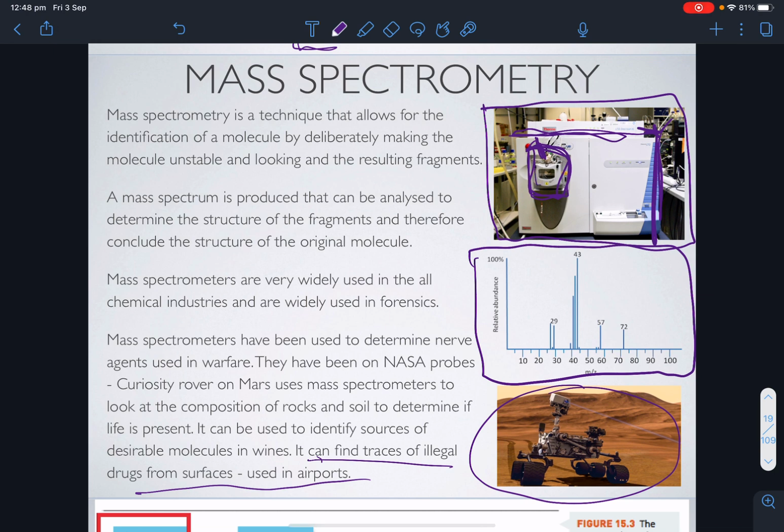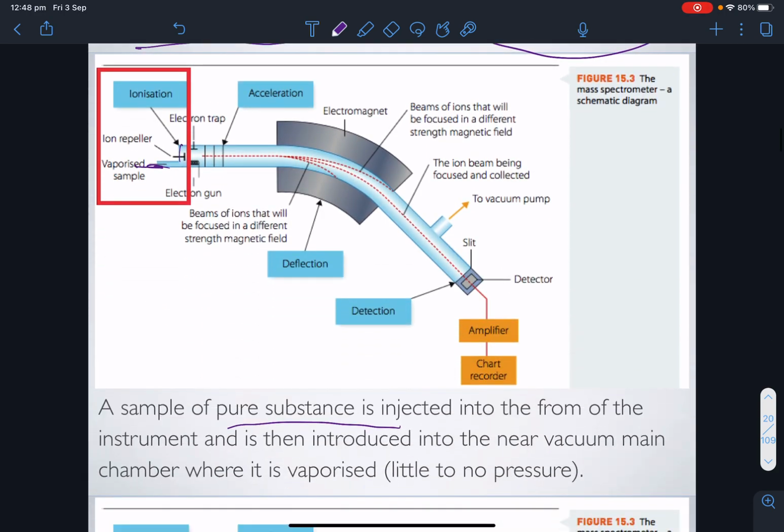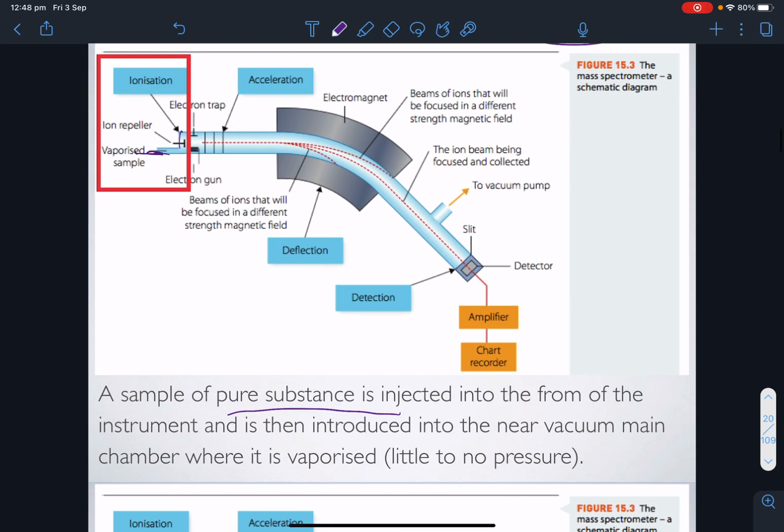You can also, a lot of research in the last 10 years has been, instead of us directly injecting a prepared sample, open air sampling, where we use a needle or a probe to directly go into a sample at different points. Anyway, usually most samples are just put into a solution of some kind and injected in there.